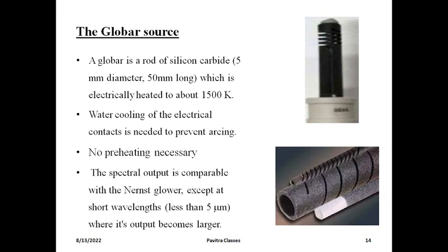Water cooling of the electrical contact is needed to prevent arcing. So the rod will create arcing when it reaches that temperature. Then water cooling is needed. No preheating is necessary. Directly you can put it in.